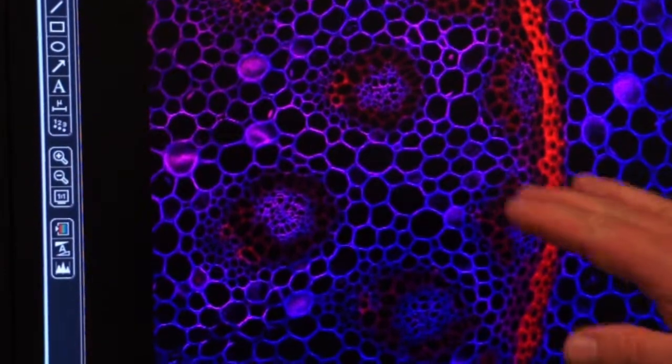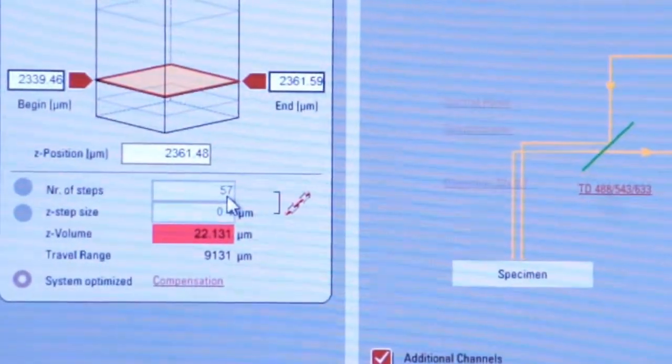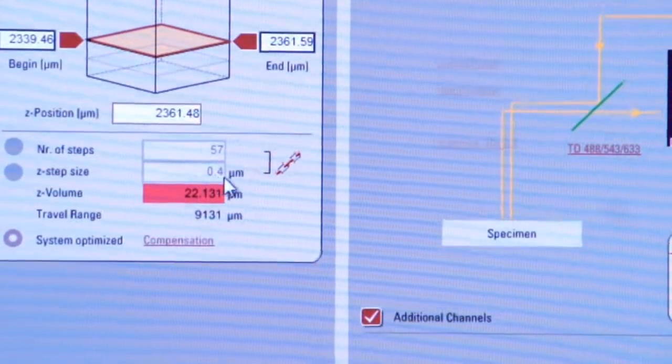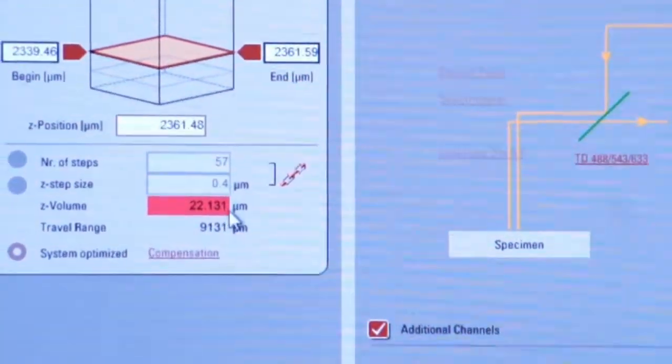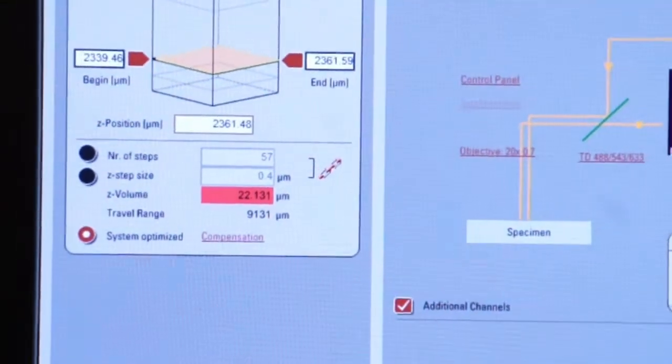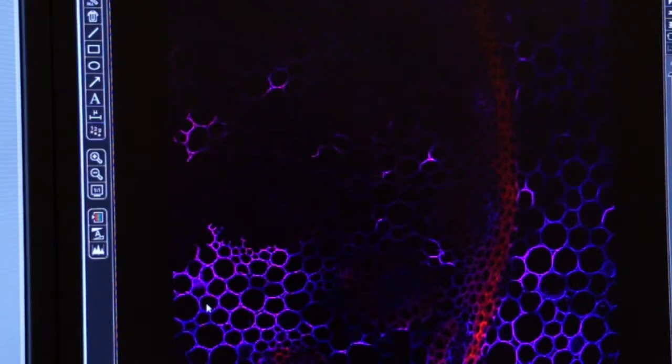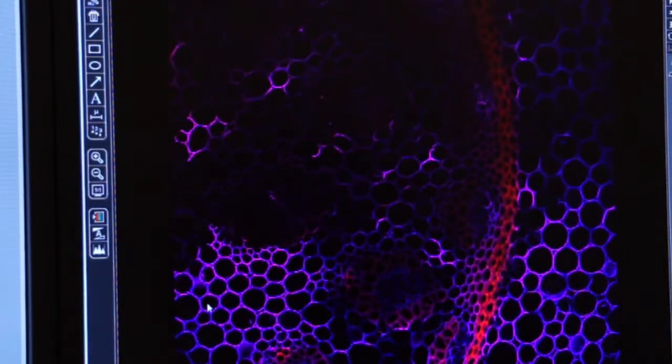So there we selected now a portion at the above point of the focal plane. We'll go back to the Z-Stack menu and click on the end bar. Now the system has told us it's going to do 57 steps. The size of each step is almost half a micron, 0.4 microns, and the total volume is 22 microns. We click on stop, and now we come over and we click on the start icon. And now the system is going to go back to our beginning point, and it's going to start collecting images from that beginning point at each time. It's going to shoot a picture, make a digitized image of each plane 57 times through that 22 micron volume.